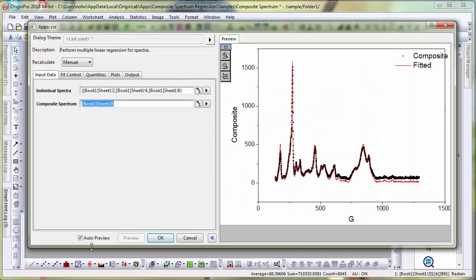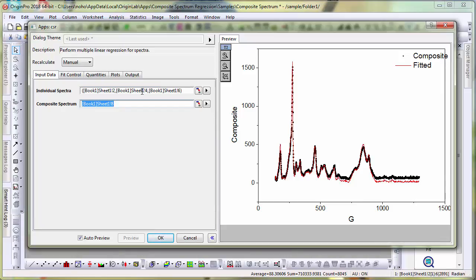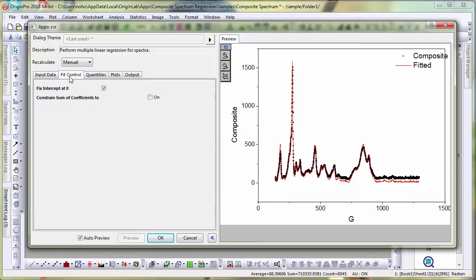There is a checkbox for Auto Preview which will show you the composite spectrum and the fitted curve. The fit looks good. So let's go to the fit control.